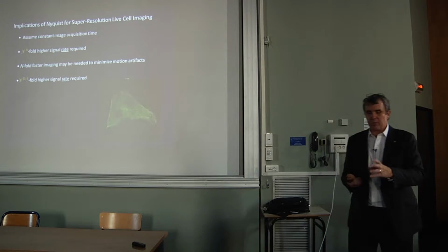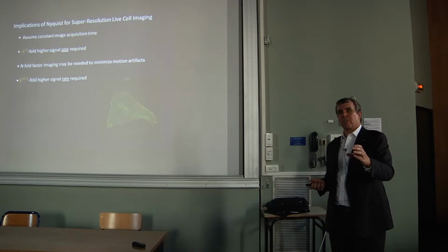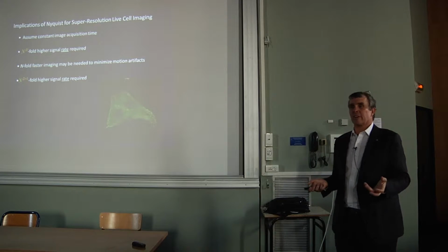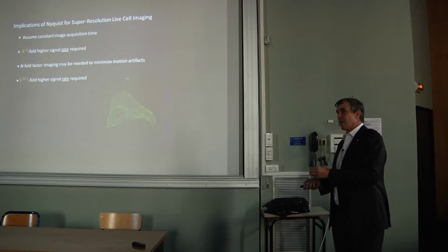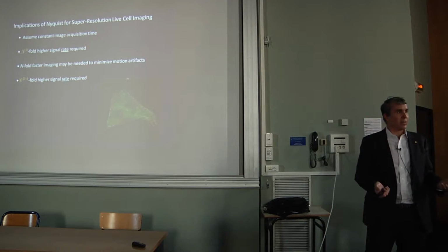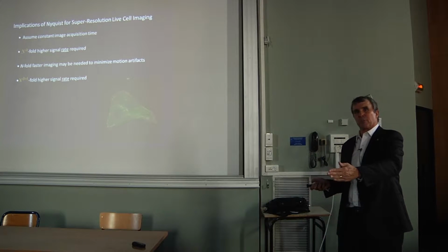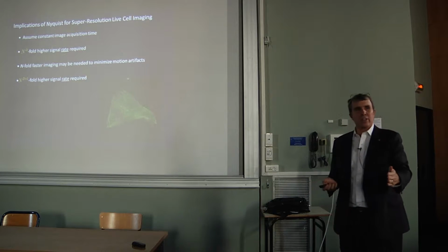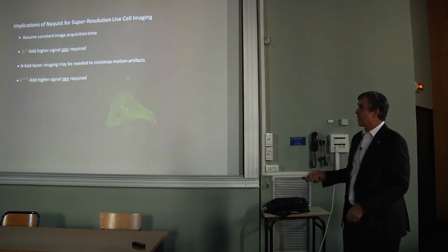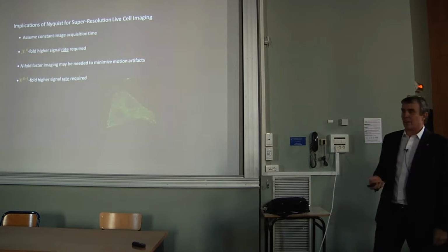But furthermore, it's worse than that, because if I want to look at a feature that's traveling at 1 micron per second, if I had 1 micron resolution, I can afford to take a second to get the image. But if I want 10th micron resolution, I can only have a 10th of a second to snap that image. So there's a bad relationship that as the spatial resolution improves, the temporal resolution has to move in direct proportion, or else you're going to get motion artifacts. So that means the signal rate now has to be n to the d plus 1 times higher.